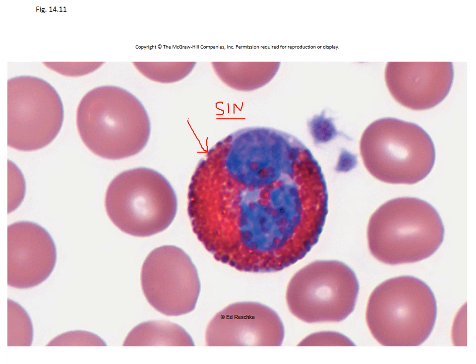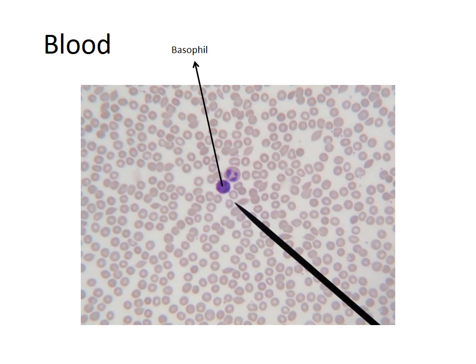Now, one of the things we're going to learn about the eosinophil when we are in lecture is that this is really big in allergies. If you suffer from allergies, your eosinophils kind of go a little haywire. So that's the eosinophil. The next one, again, this is still in the granulocytes, is called a basophil.